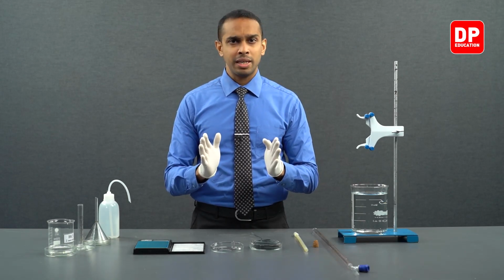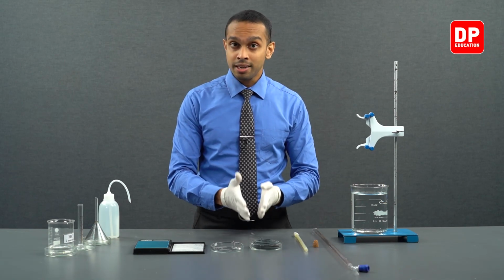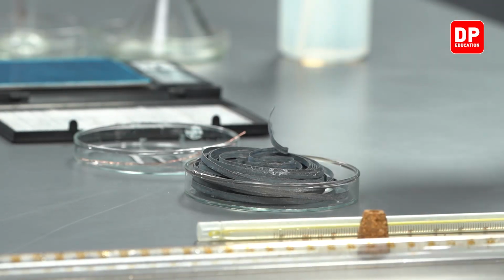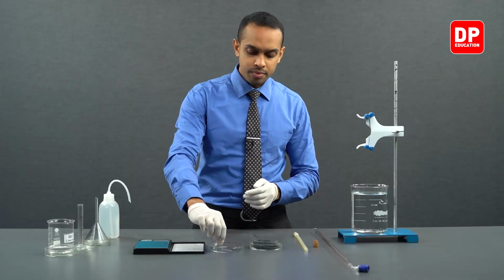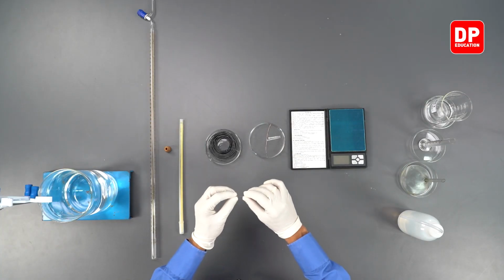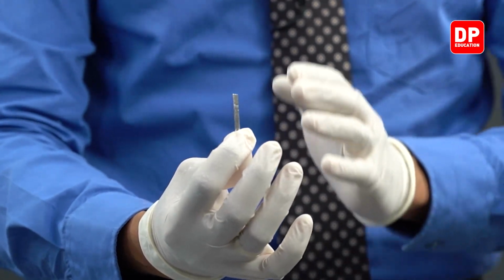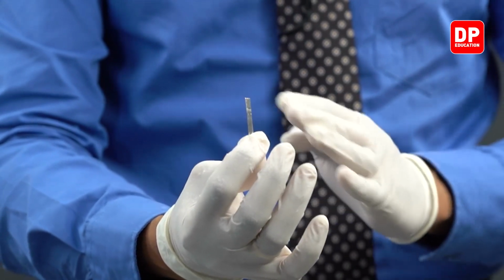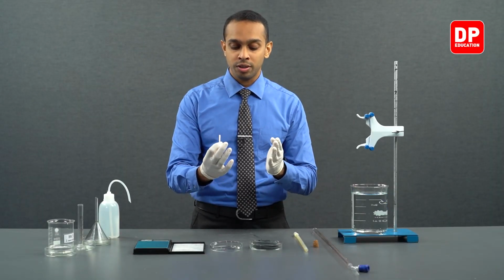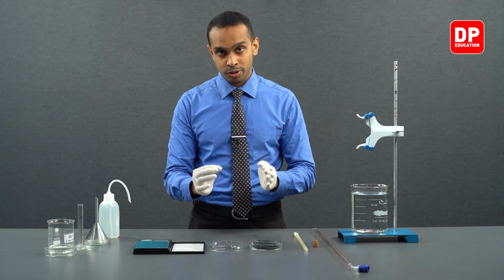Before we use magnesium for any reaction, we need to make sure that you sand down this gray magnesium oxide layer so that you obtain this shiny silver color magnesium pieces. Magnesium strips here after sanding down the magnesium oxide layer that was coated on top of it. So before we use magnesium for this experiment, we have to make sure to sand down the magnesium oxide layer.